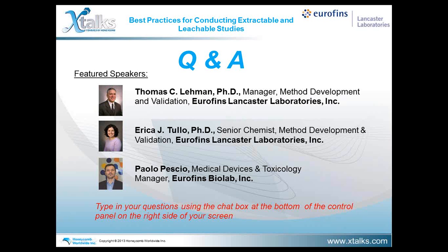Pertaining to the first part of the question about when in the process is it appropriate to do these studies, my opinion is the earlier you perform the work, the better off you're going to be. This allows you time to perform an appropriate risk assessment. It also allows you to evaluate your process to see if your process is appropriate. If you're early enough in your process, you may come across a component that may be at more risk than what you would like to introduce to your process. So there may be time to change out that material. And finally, these studies do not happen overnight. They do take time to go from the very beginning to the very end, so they should be added into the process early enough to ensure that adequate time exists to gather all the data and perform the appropriate assessments to put your package together.